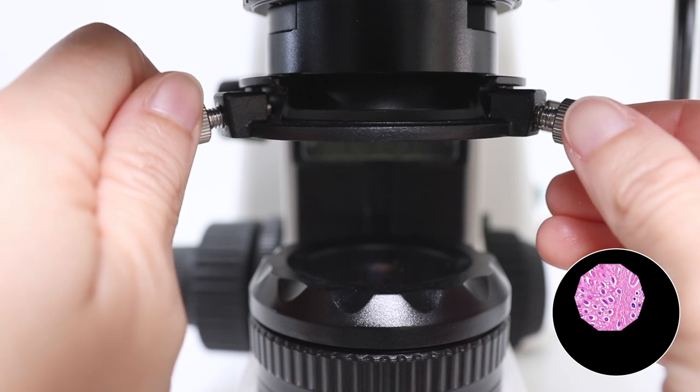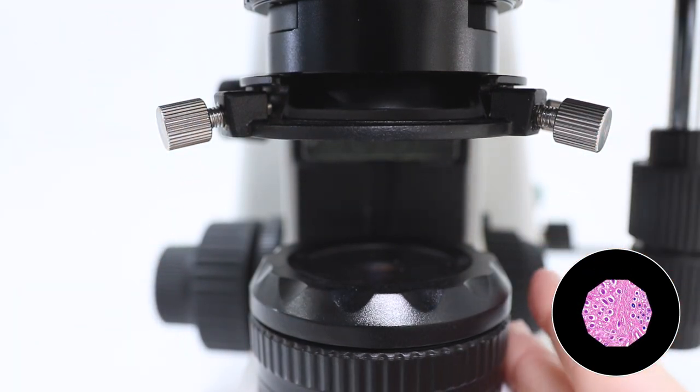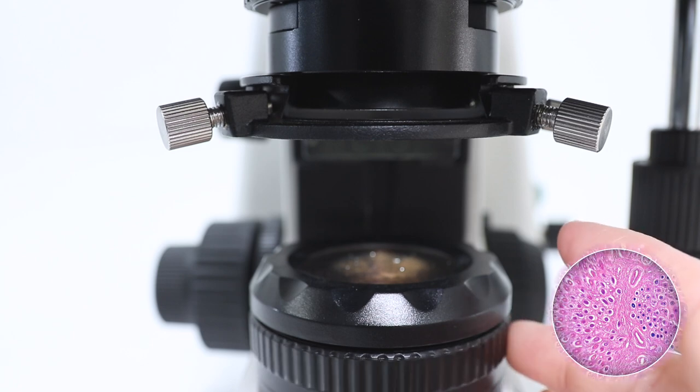Next, center the field diaphragm by using the two centering screws of the condenser. Finally, open the field diaphragm until it remains just outside of the field of view.